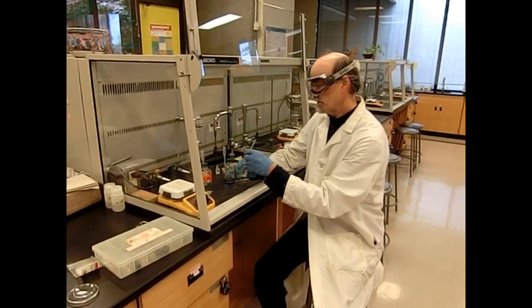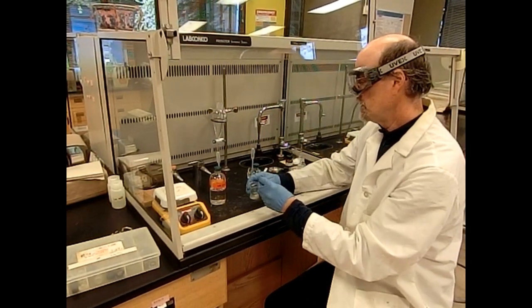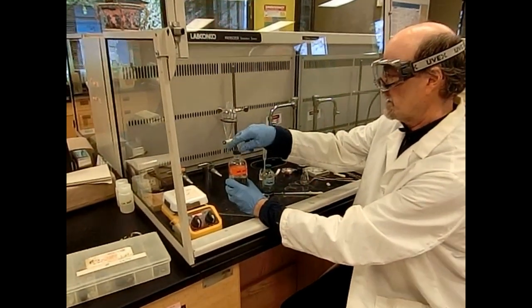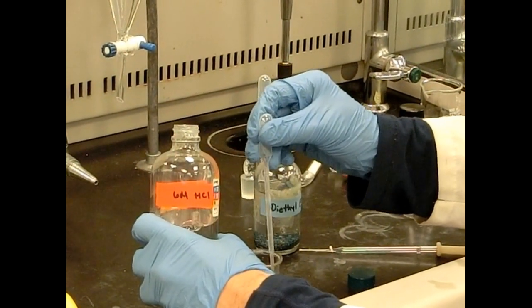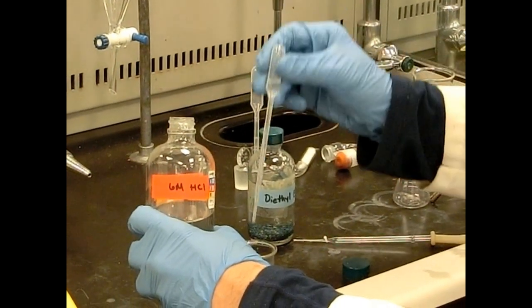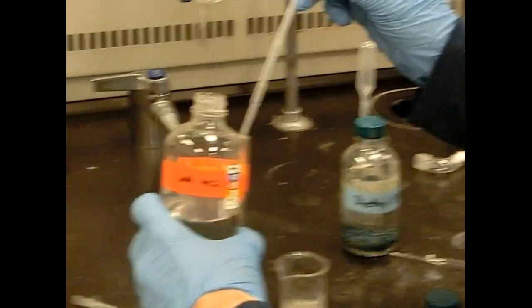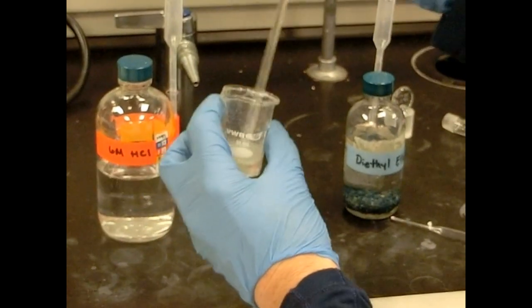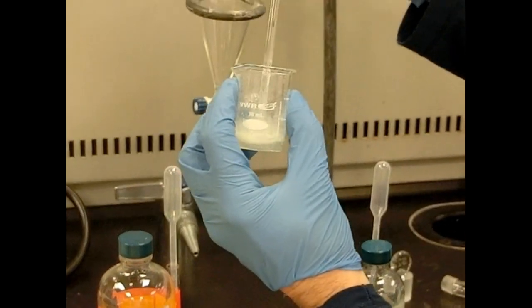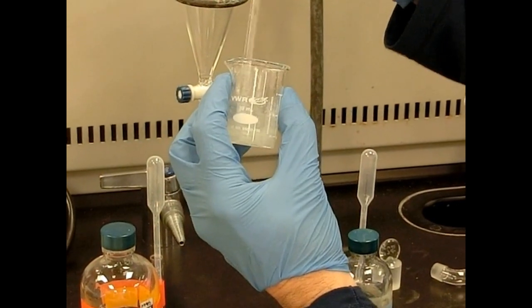So we're on our last step. We have our Grignard. All the dry ice is sublimed. We have a little bit of ether in our gummy residue. Remember this is the deprotonated benzoic acid. So I'm going to reprotonate it with six molar HCl. And you can add roughly five mL to this. So this will reprotonate it. We won't see much change at this point. And so the HCl is an aqueous system. Stir this up a little bit to make sure everything reacts.